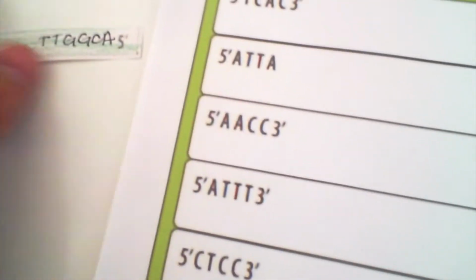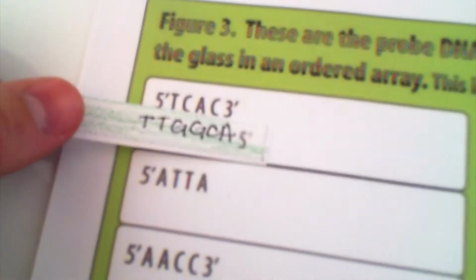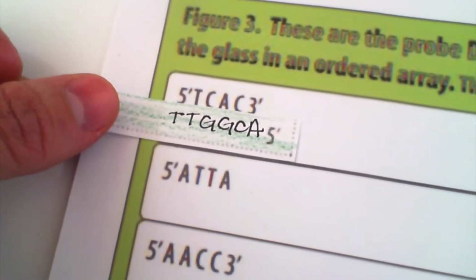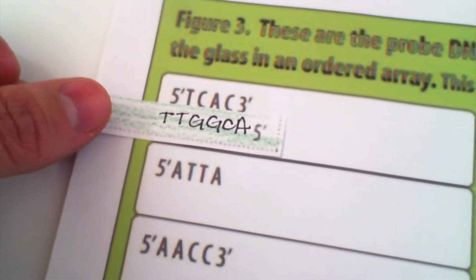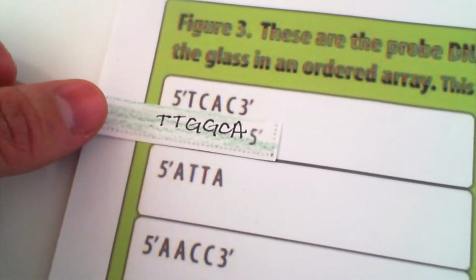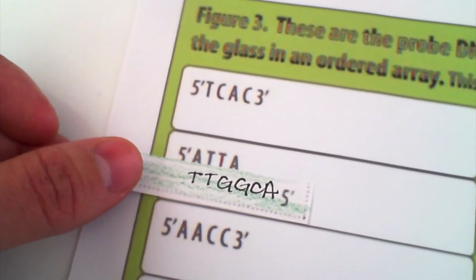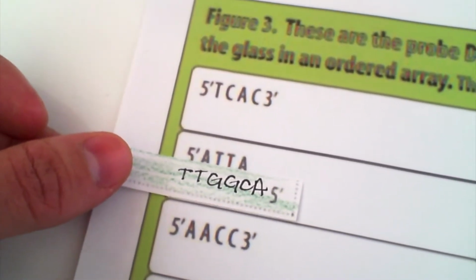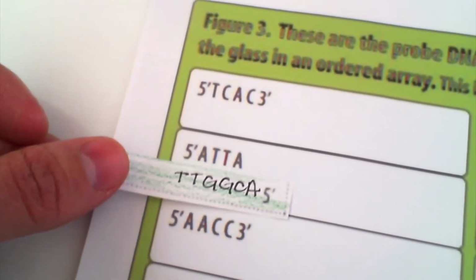But here is another cDNA from the normal plant given sun. Would this one fit? Well, maybe, because we have the G with a C, but A does not base pair with G. So that's not going to work, even if I do move it. Will it fit here? Well, A does base pair with T, but T doesn't go with T, and neither would T with G. So that's not going to work at all.